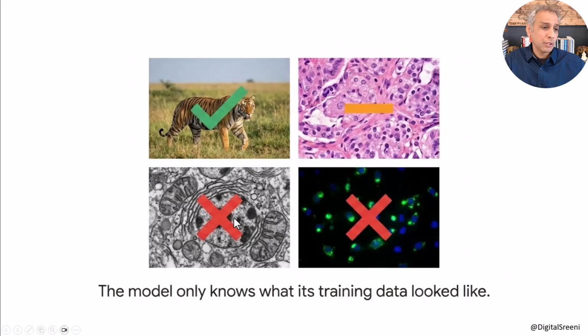Now, when it comes to electron microscopy images, again, these are not in color typically, of course, right? Unless someone applies false color. These are grayscale images. This is where it more often fails than not, meaning it probably gets 50%, and for the remaining 50% you have to use SAM or something to fill that gap. In pathology images, maybe you get to 80%, especially if it's glomeruli, for example. Even 90% actually for these types of examples. Again, we'll test these. And fluorescence microscopy, same story, bright spots on a black background.